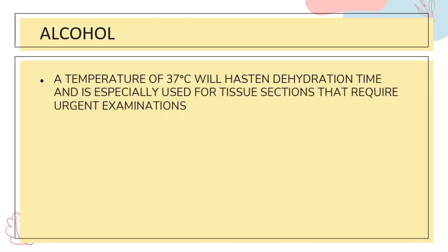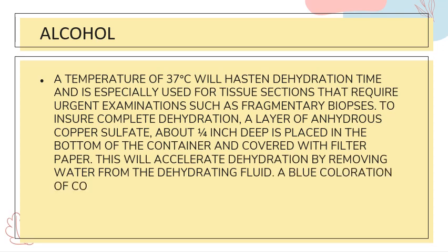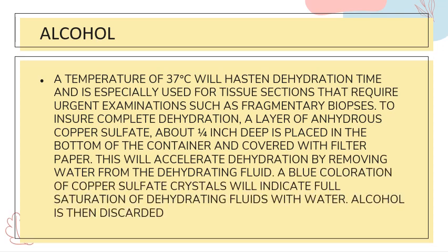A temperature of 37 degrees will hasten dehydration time and is especially used for tissue sections that require urgent examinations, such as fragmentary biopsies. To ensure complete dehydration, a layer of anhydrous copper sulfate, about 1/4 inch deep, is placed in the bottom of the container and covered with filter paper. This will accelerate dehydration by removing water from the dehydrating fluid. A blue coloration of copper sulfate crystals will indicate full saturation of dehydrating fluids with the water. Alcohol is then discarded.